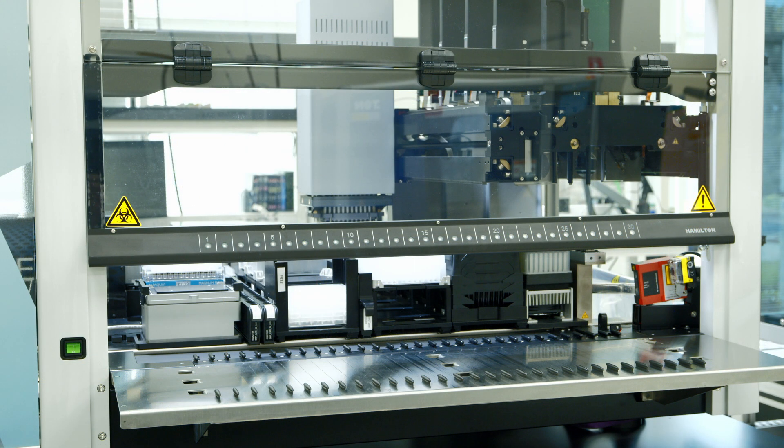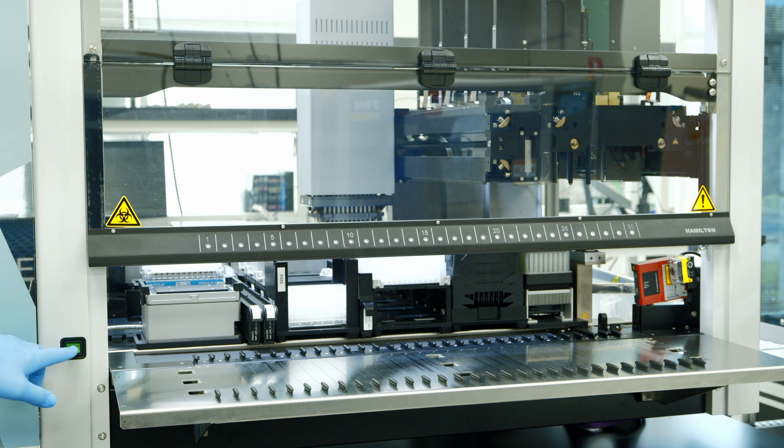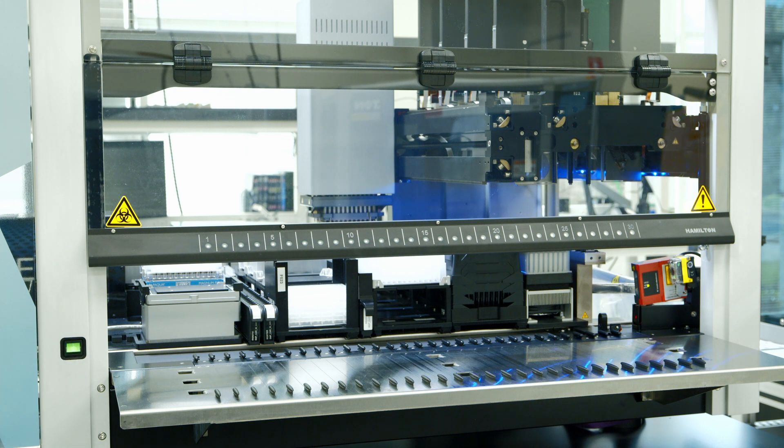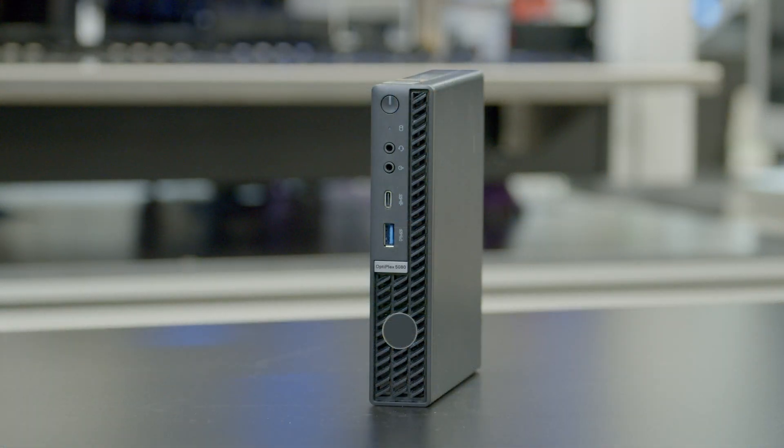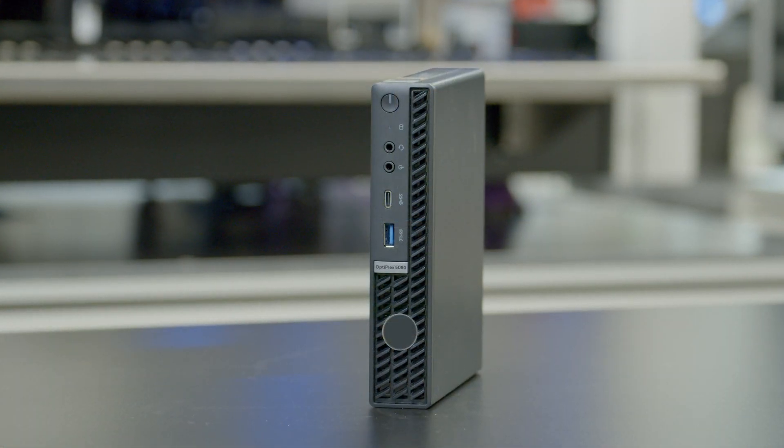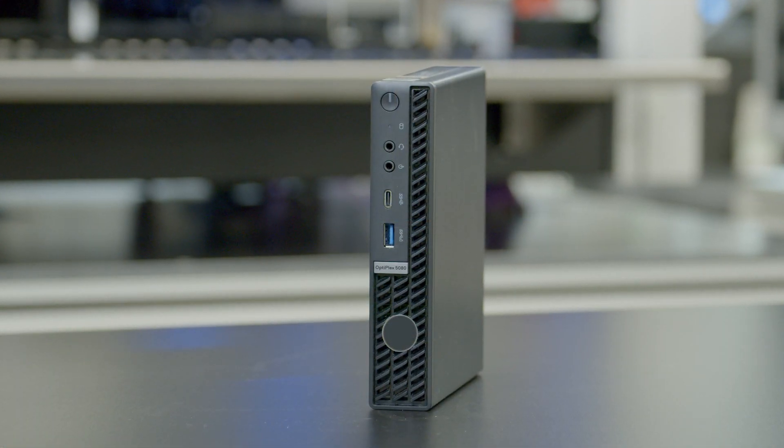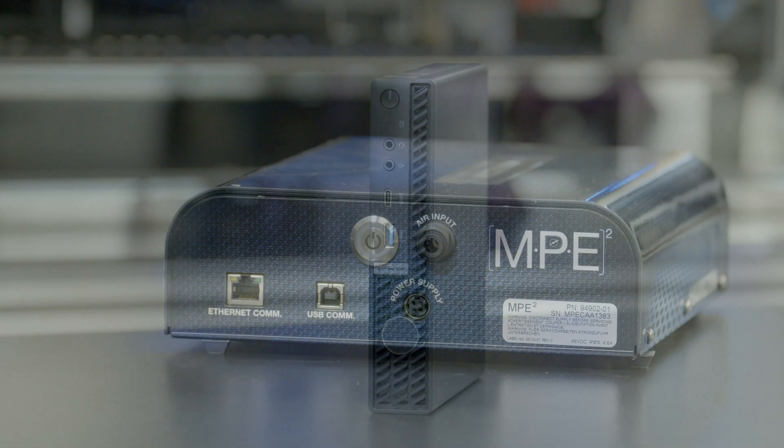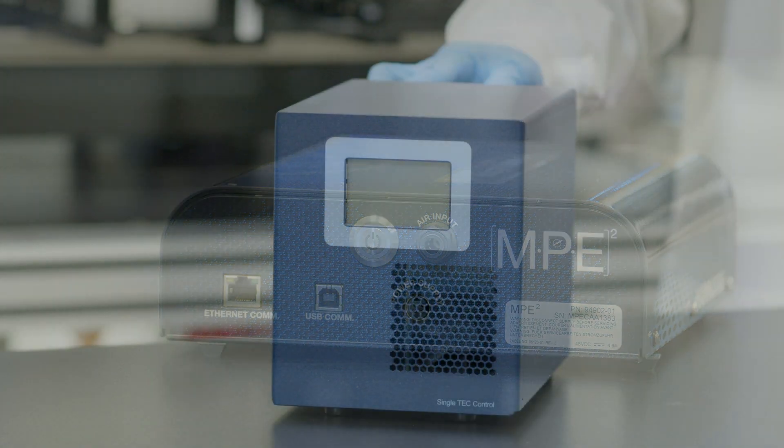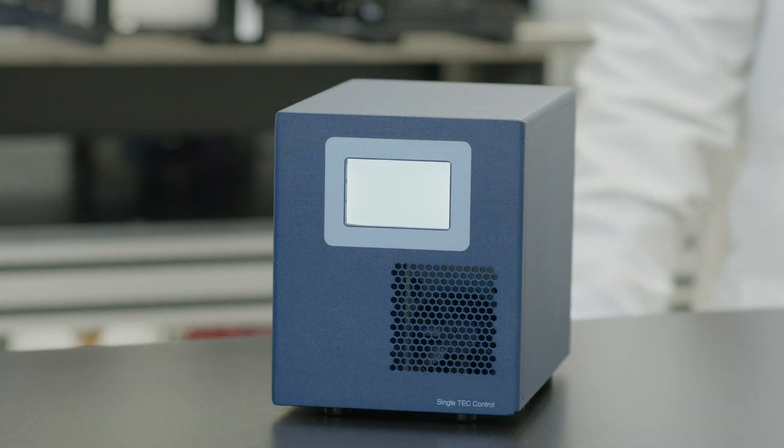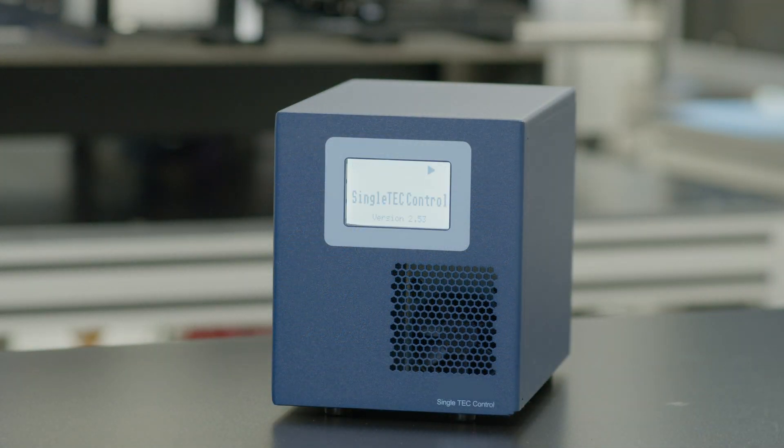The instrument power button is located on the front left side of the instrument. There are three additional units that need to be powered on: the computer that powers the SEER instrument control software or ICS, the MPE power unit, and the chiller power unit.